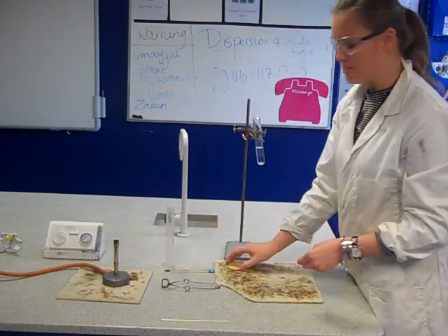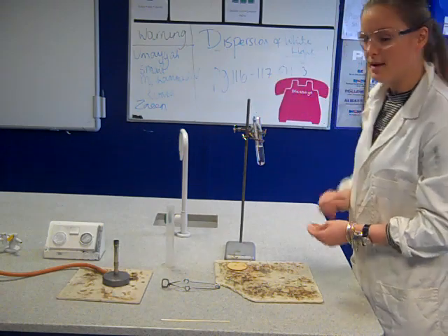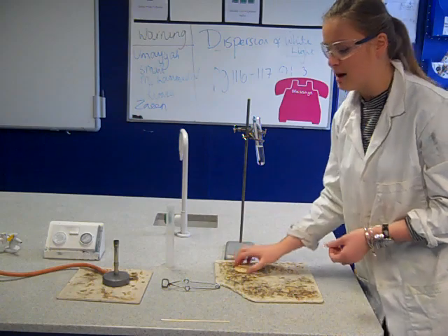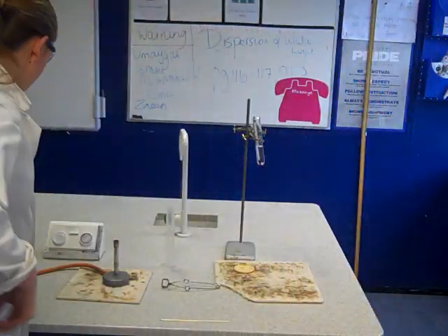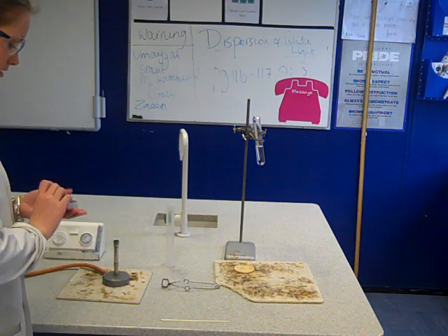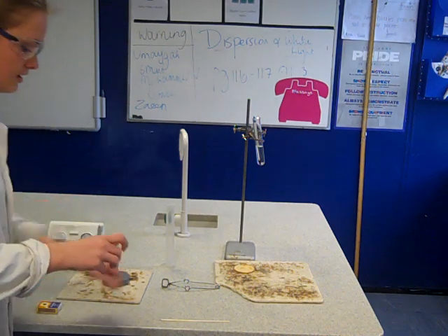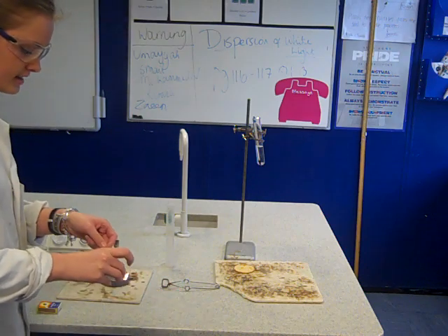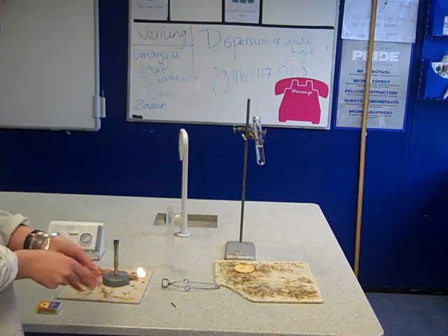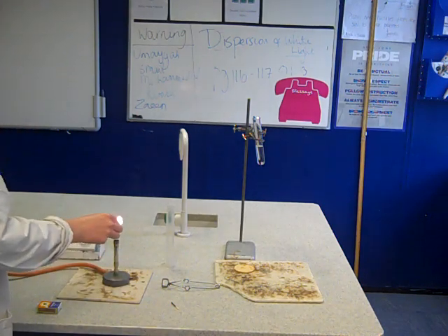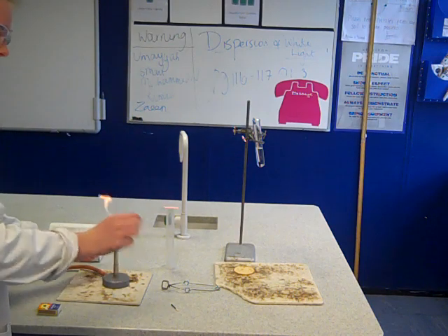All is left to do is to burn our food. So I need to measure the temperature at the beginning using my thermometer, then I'm going to actually burn my food. So I'm going to set up my Bunsen burner. Make sure you're lighting this safely. Your teacher will light her match and you can use a splint. Making sure we're doing that safely.